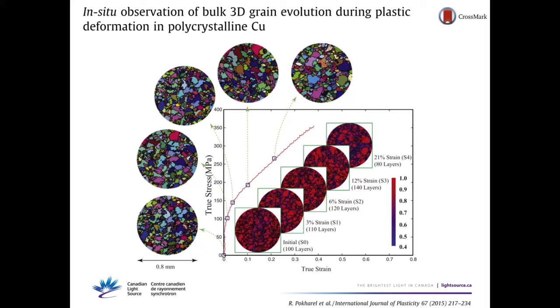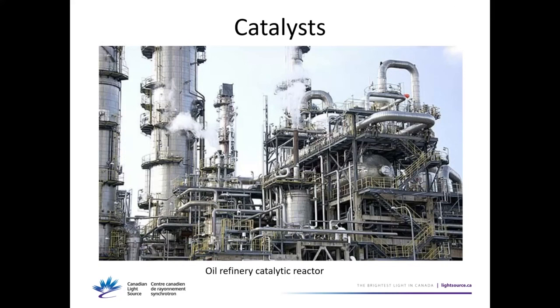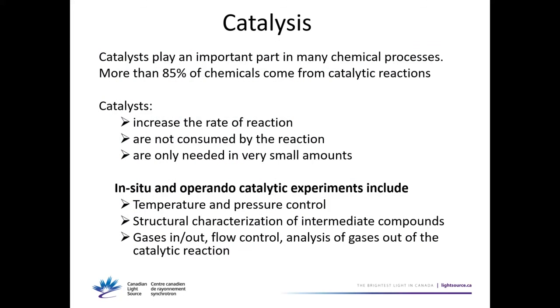And I'm going to show one quick example about catalysis. Does everybody here know what a catalyst is? Well, they're super important. They're nearly everywhere. They speed up reactions. Sometimes they make them possible, sometimes they make them much cheaper. So really they are everywhere, and without catalysts, we wouldn't be here. Life would be different.